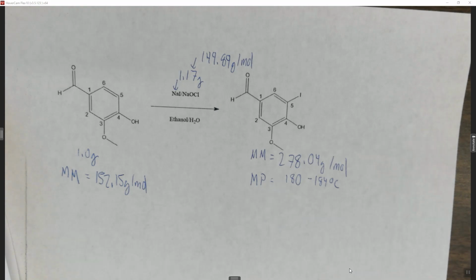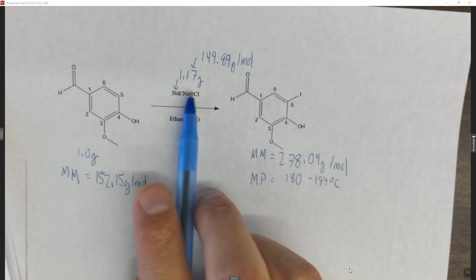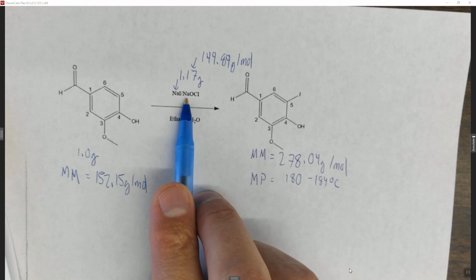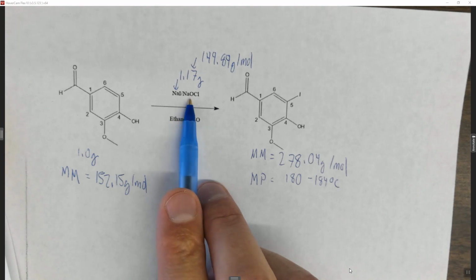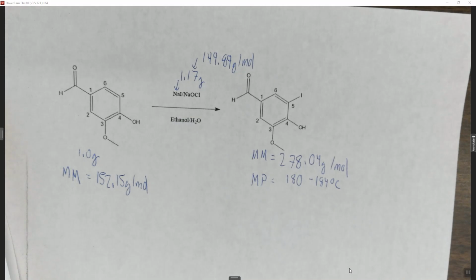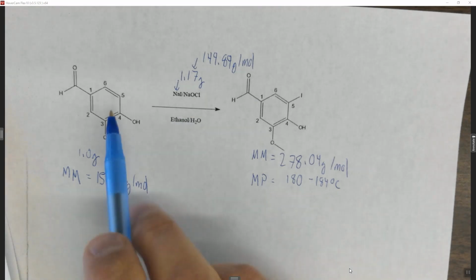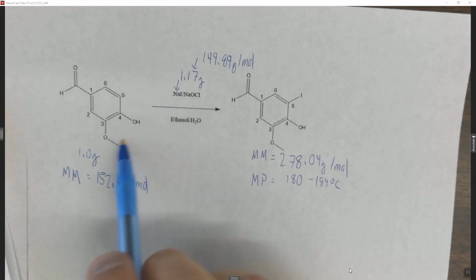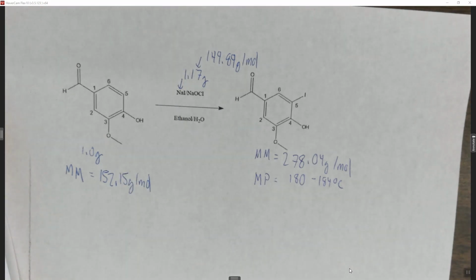So you have a lot going on here. The most important thing is we destroy that bleach with about 10 milliliters of our 10% sodium thiosulfate solution before we add the HCl, because bleach and HCl makes chlorine gas, and chlorine gas is poisonous. Also, again, just remember when you're back at the beginning stages, make sure that you get rid of all that I2, make sure you stir long enough so that your solution is no longer red-brown. So it's a little confusing because you add the bleach, it turns red-brown, then you take it out of the ice, and then the red-brown goes away. So that's what we want to happen because we want to form that I+.